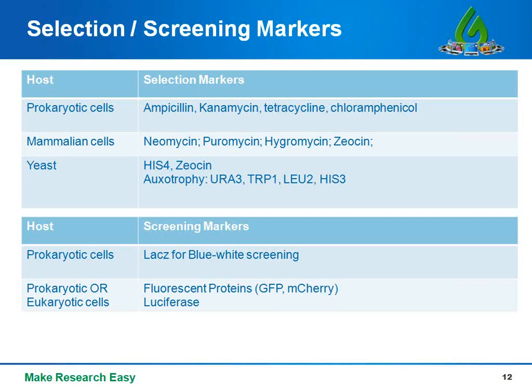Another commonly used reporter is luciferase. So luciferase enables easy quantitative readout with a luciferase assay in which a substrate is added that will be cleaved by your luciferase enzyme to emit light, and the light can be read by a luminometer. This is making use of the same reaction that fireflies use to glow in the dark.